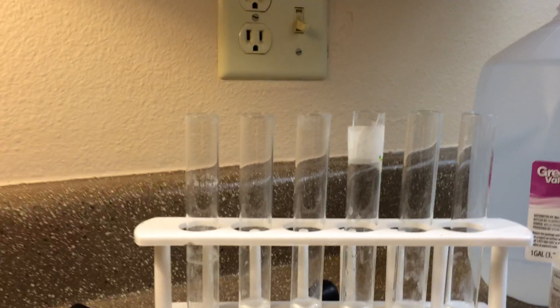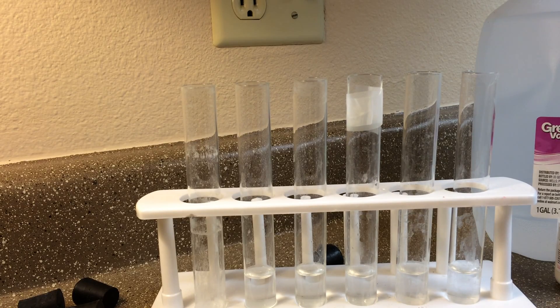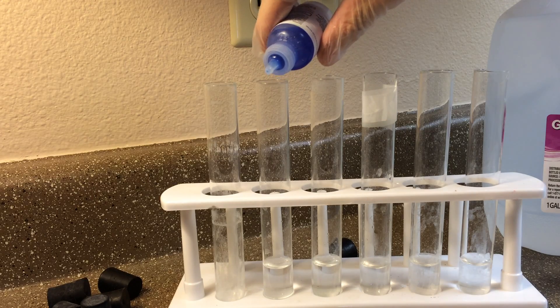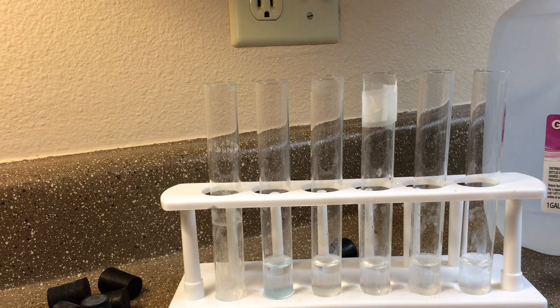Here we've got distilled water lined up to about the same height in all these test tubes. We're gonna try to make this quick. The first one — we're gonna put five drops of Biuret reagent in distilled water: one, two, three, four, five. So you can see what it looks like in just regular distilled water.